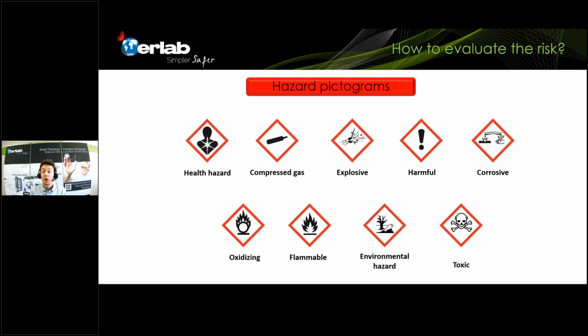Just to give you an example, how can you minimize the risk when you work with flammables? By storing them in a fireproof storage cabinet. So looking at these hazardous pictograms, you know what the risk is, and you need to look for the appropriate safety solution in order to minimize the risk that you're exposed to.